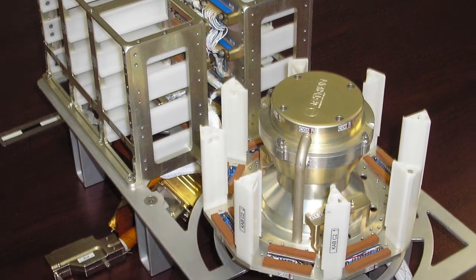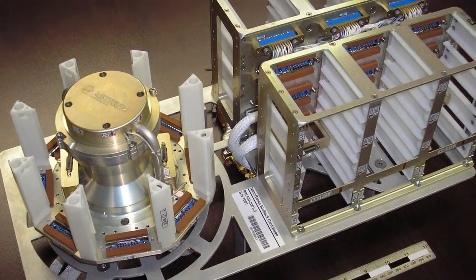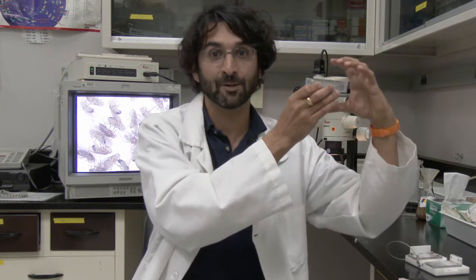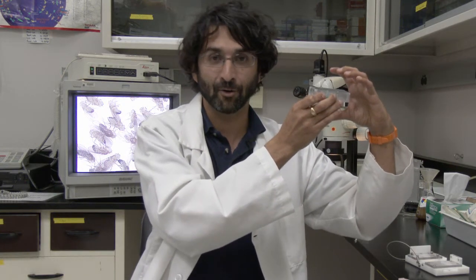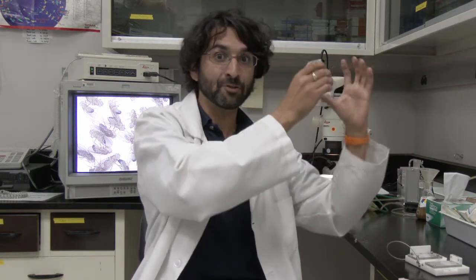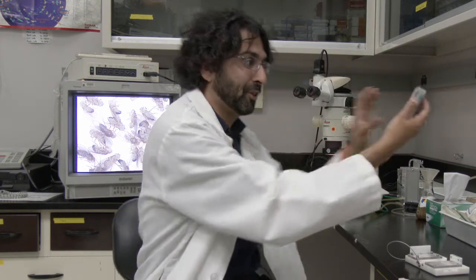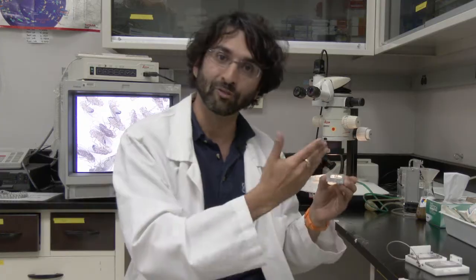These slots are the same on the centrifuge, which is right next to where we're going to be living. So the flies go into the observation system. The observation system goes into what's called a biorack, in which they will sit in space. This is in microgravity. Right next to it is a centrifuge that will house also the observation unit and the cassettes, and the whole thing will spin. The reason it's spinning is that it's going to impose an artificial gravity, like we have on Earth, to the flies.